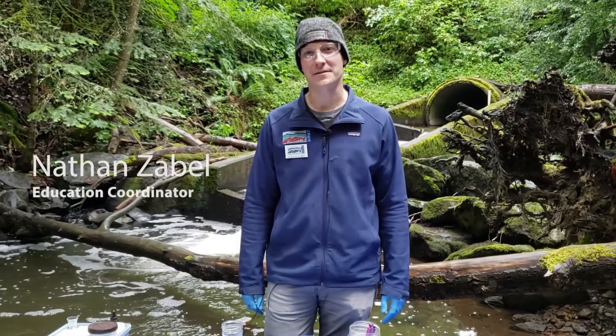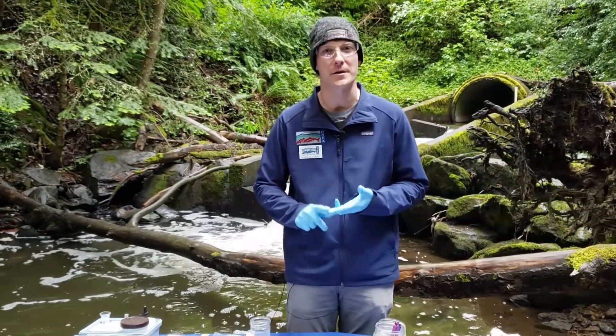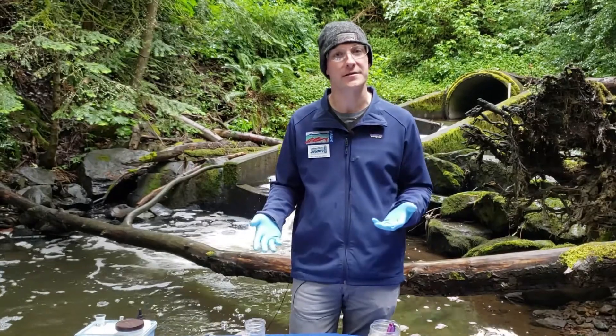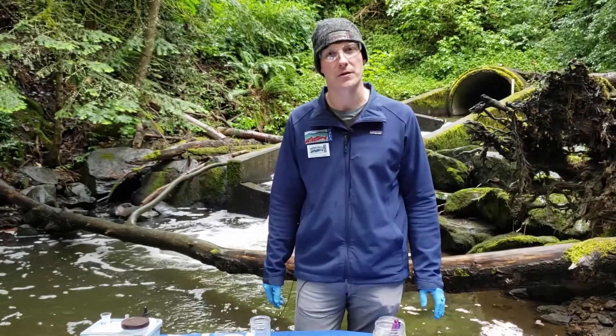At this station, we're going to test the quality of the water from Padden Creek and determine if it is cold, clean, and clear for salmon. You may recall those three C's. Here's our opportunity to test some of those using scientific equipment and determine how healthy Padden Creek is based on the water quality.